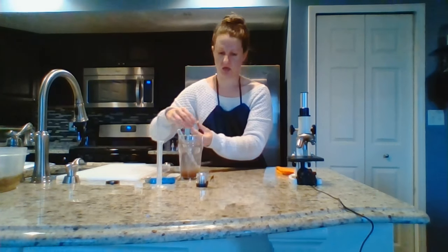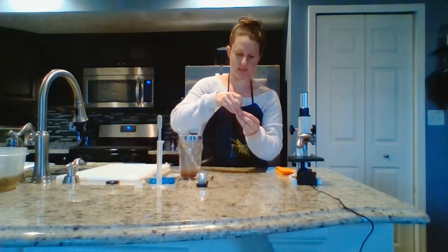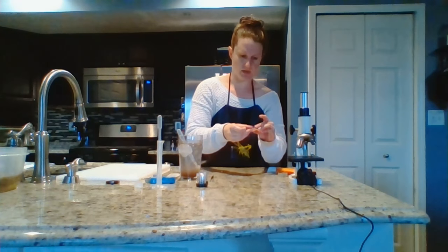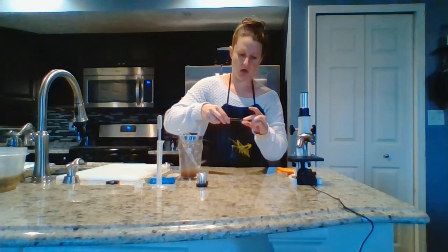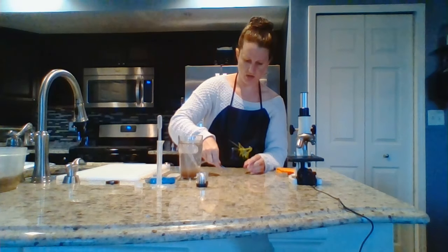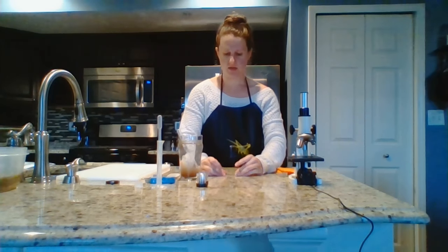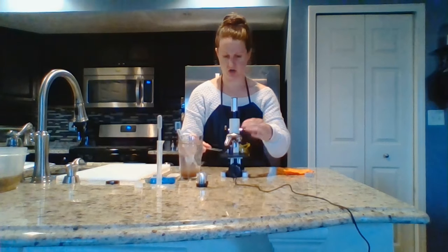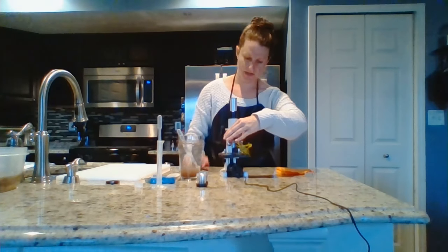Then, using your forceps and a cover slip, gently place a plastic cover slip on top of the brine shrimp. All you want to do is just drop it on — you don't want to squish them down. Then take your wet mount slide and load it into the microscope the same way you did the prepared slide.